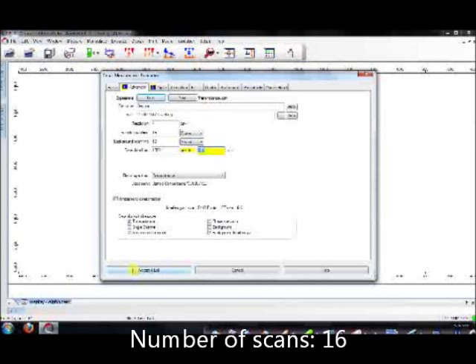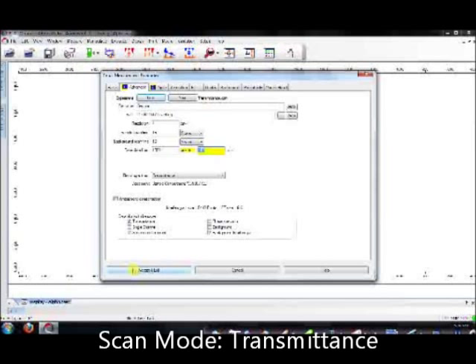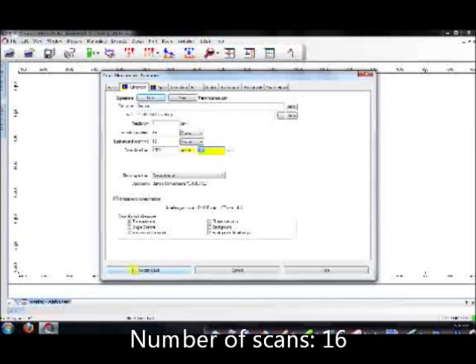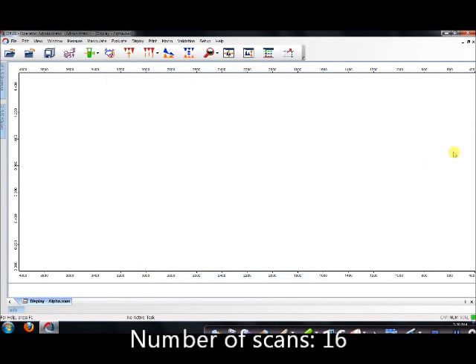So for any normal undergraduate sample, our scan mode has to be in Transmittance, Scan Range 400-4000 cm inverse. And of course, the number of scans is set to be at 16. Once done, you can save and exit.